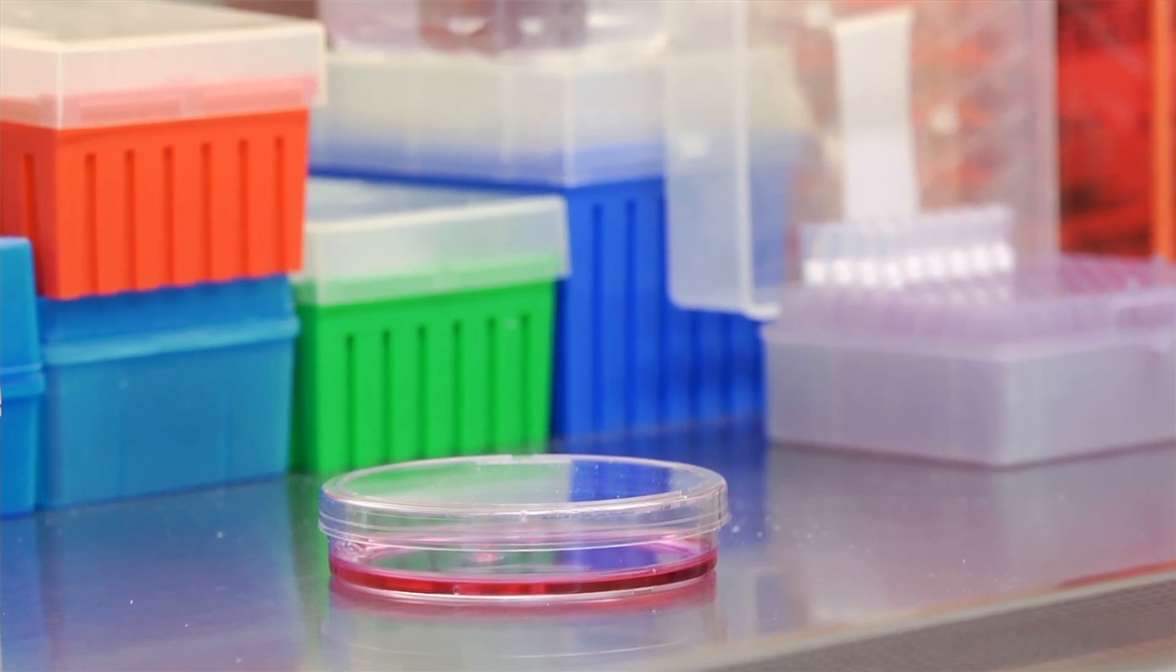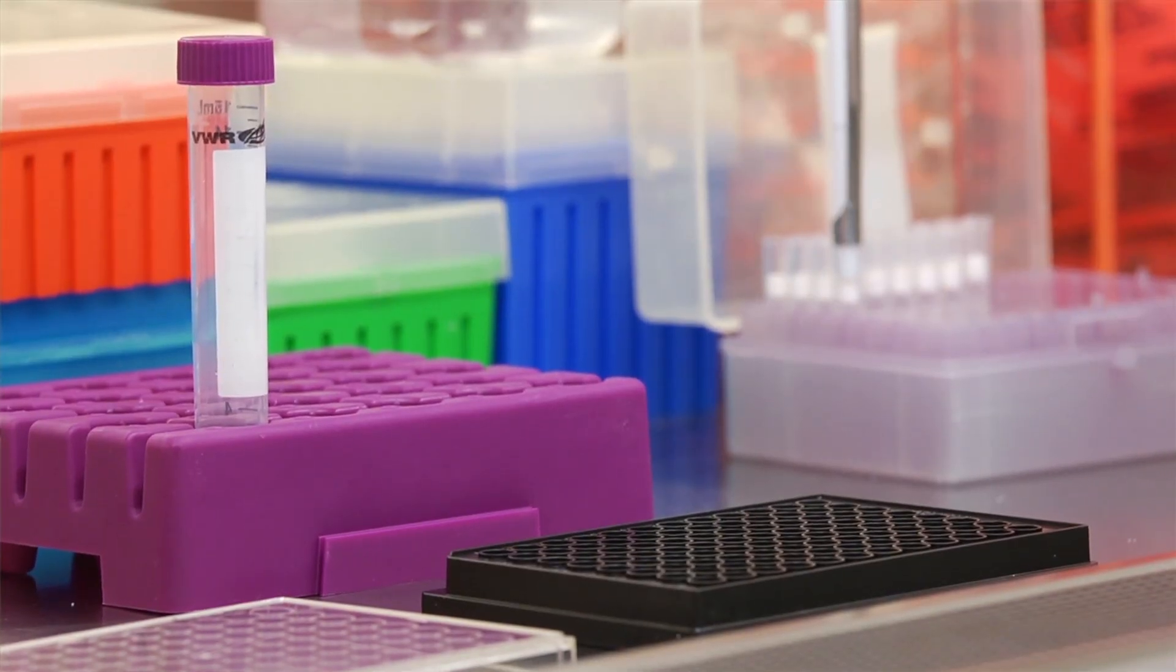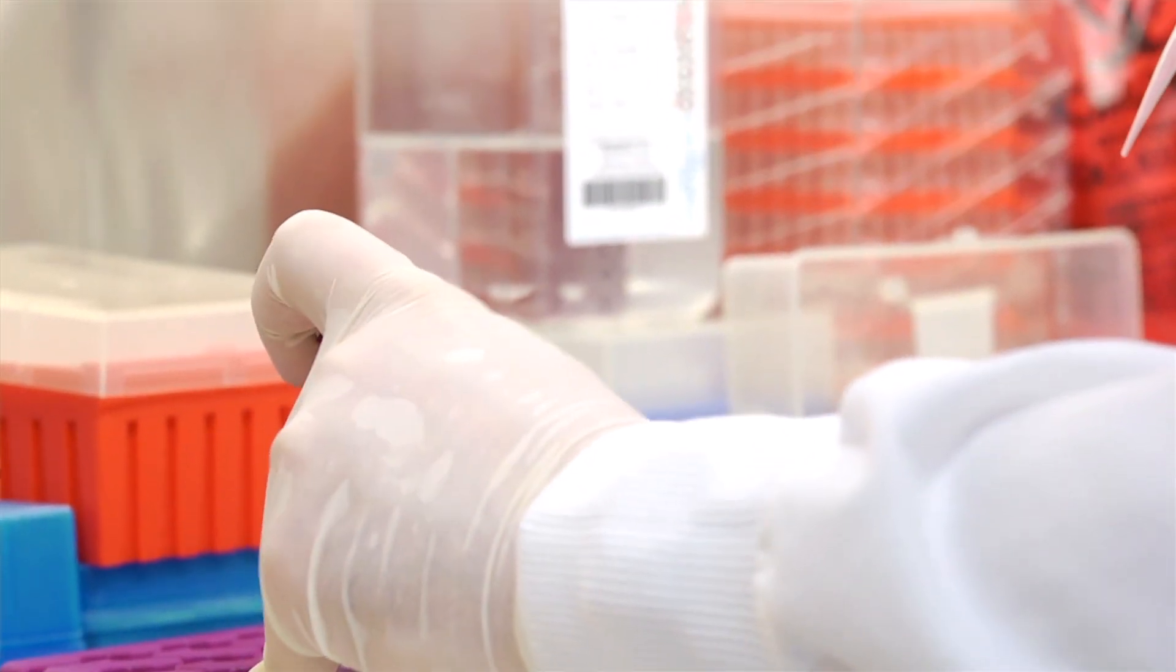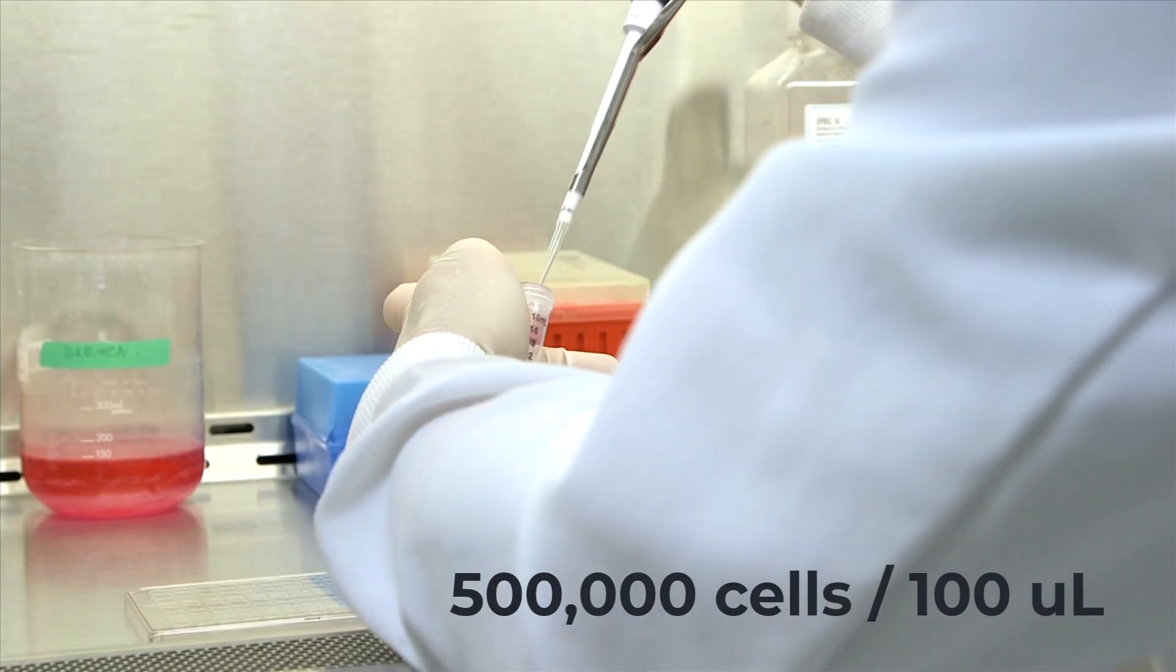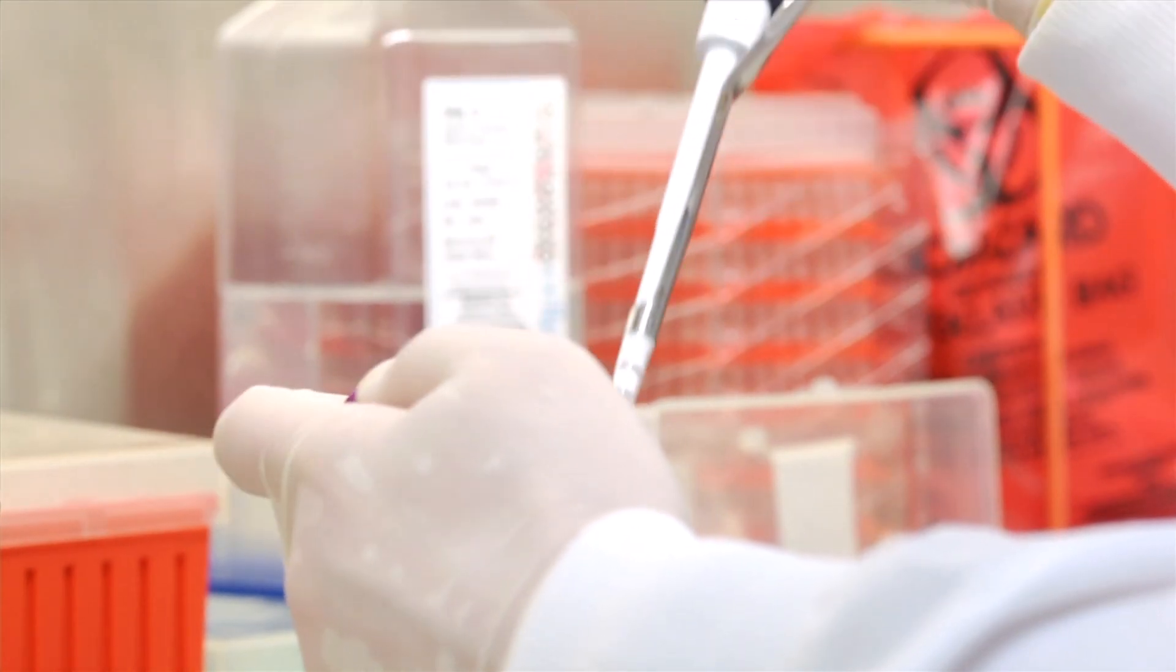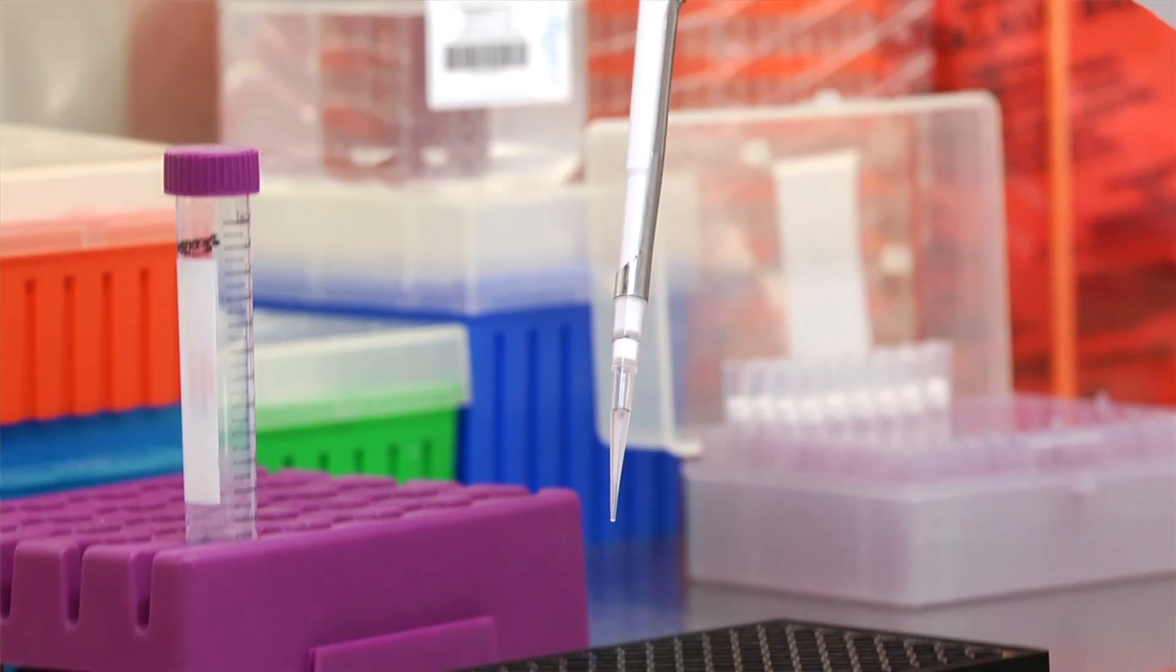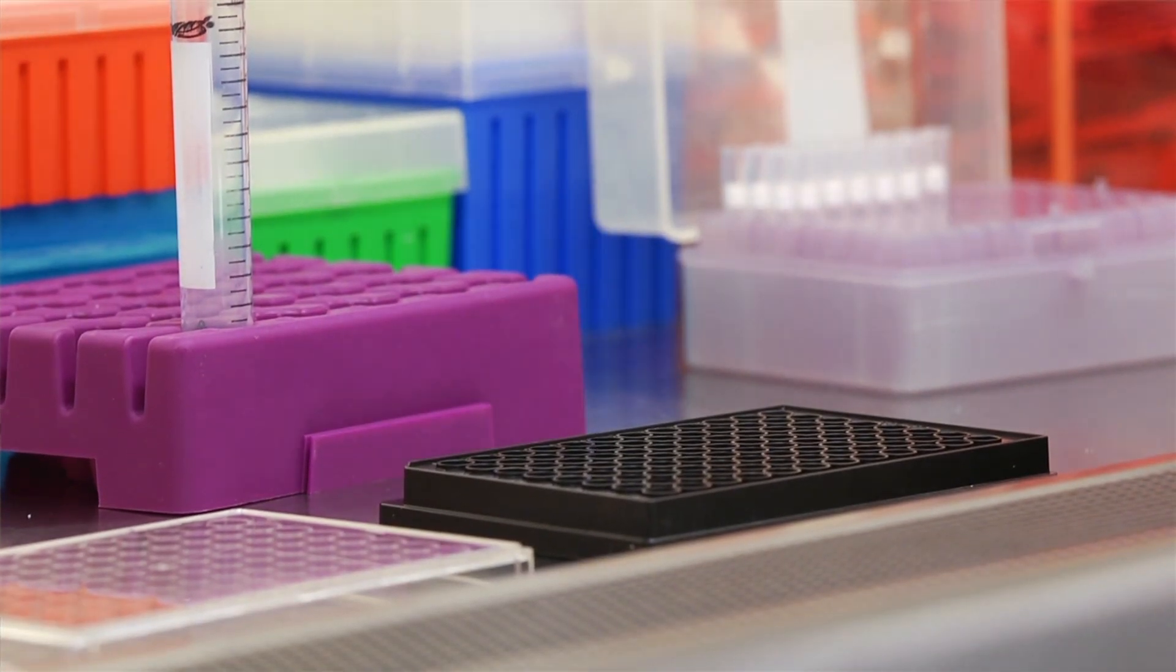The next day we wash the cells with PBS, trypsinize, pellet them down, and re-suspend the cells to a desirable concentration. In our example, the cells are maintained at a concentration of 500,000 cells per 100 microliters. The cells are then added to multiple wells of a black 96-well plate for imaging. We will store the cells in an incubator as we set up our software for imaging the plates.